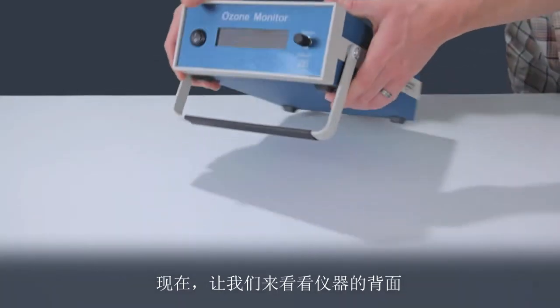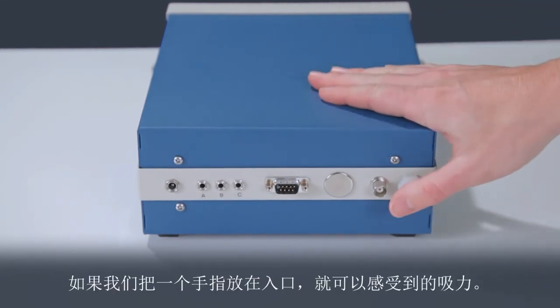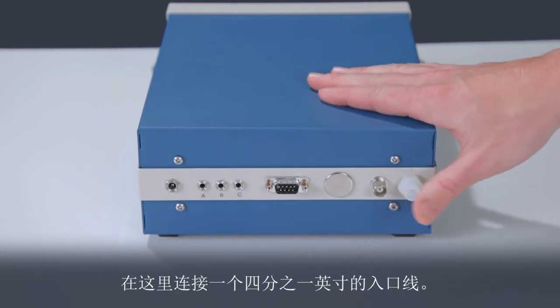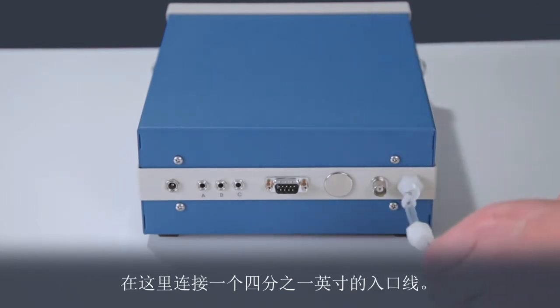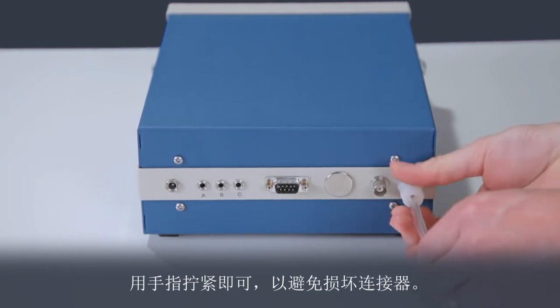Now let's take a look at the back of the instrument. The connector on the right is the air inlet. If we place a finger over the inlet, we can feel the suction. This is a standard ¼ inch swage lock fitting. We can attach a ¼ inch inlet line here. The connection should only be finger tight to avoid damaging the connector.